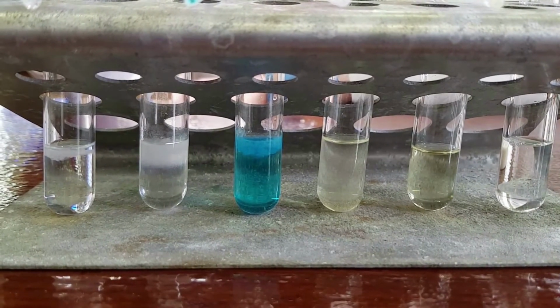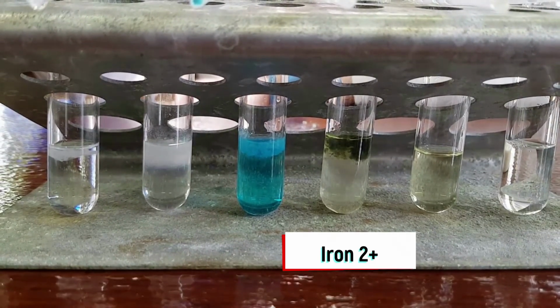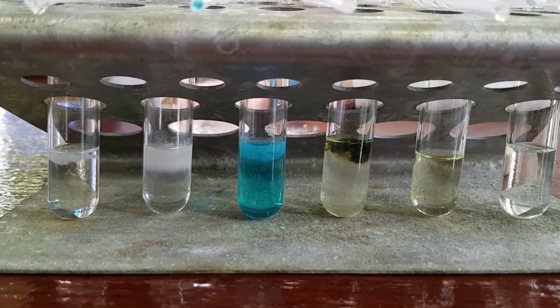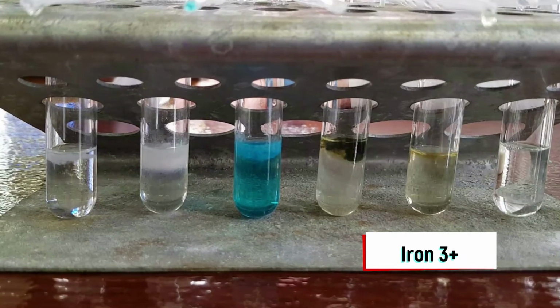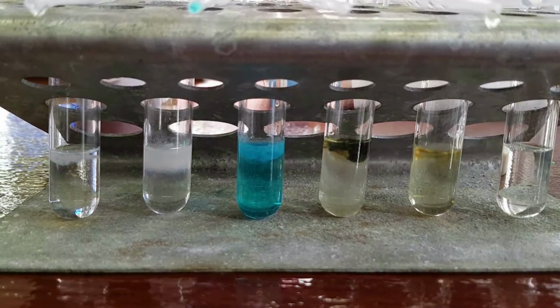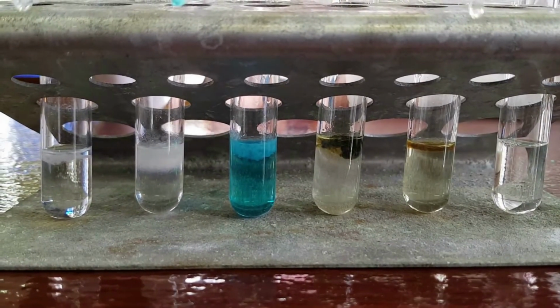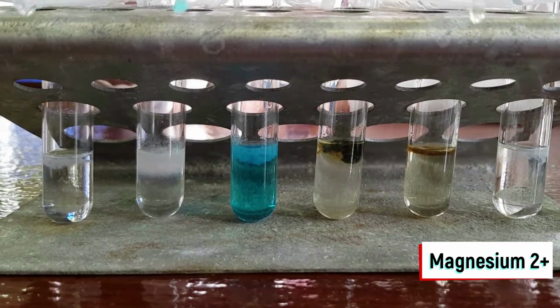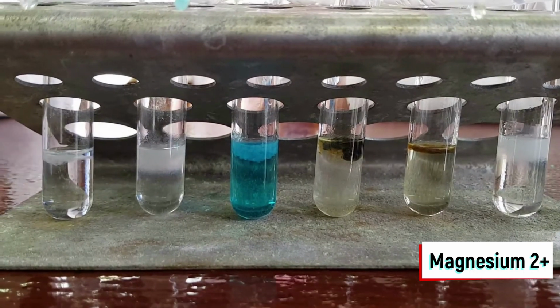Now iron 2. Now that is an unexpected colour there, not for me, but for you guys, a dark green, almost black colour being produced when hydroxide reacts with iron 2. Now for an iron 3 solution. A few more drops there, please, Mr. Reeves. And we can see a brown precipitate being formed when hydroxide reacts with the iron 3 solution, and finally magnesium on the right. And we can see a white precipitate being formed there.